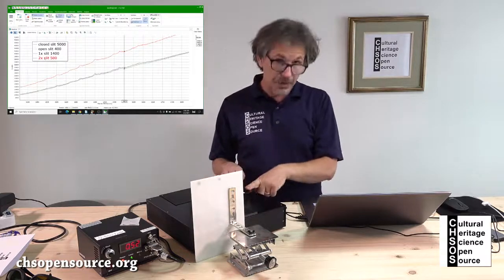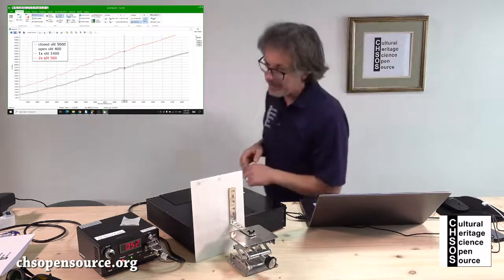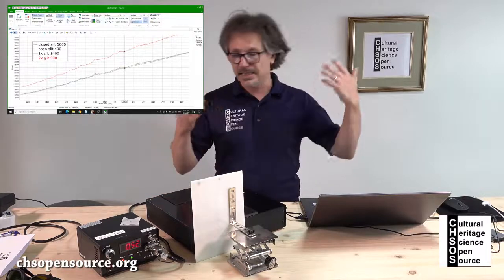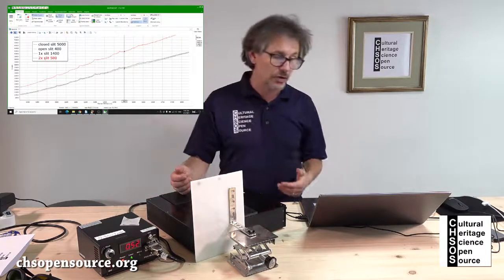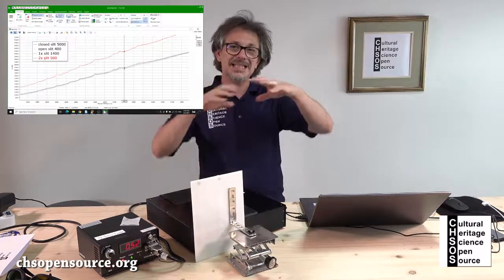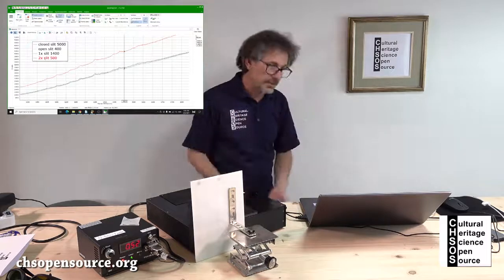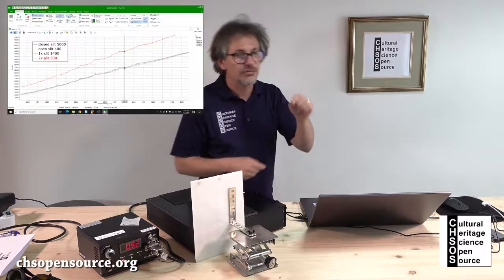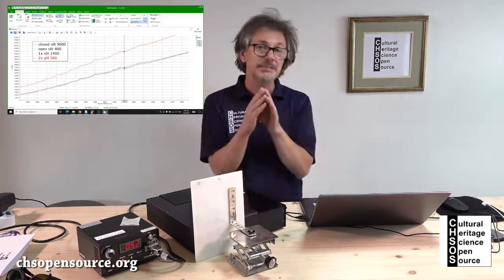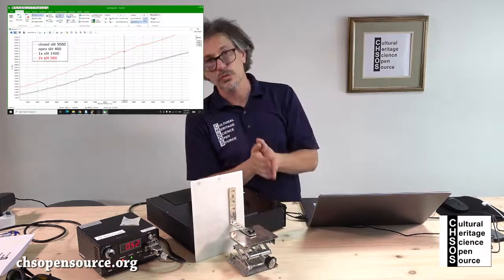The slit option, which I recommend in particular for pigments that are very fluorescent, like these organic pigments, naphthol red, where you have a lot of signal, and inside this big fluorescence you have the Raman peaks. In order to distinguish these peaks from the big curves, you need to have the maximum resolution possible.